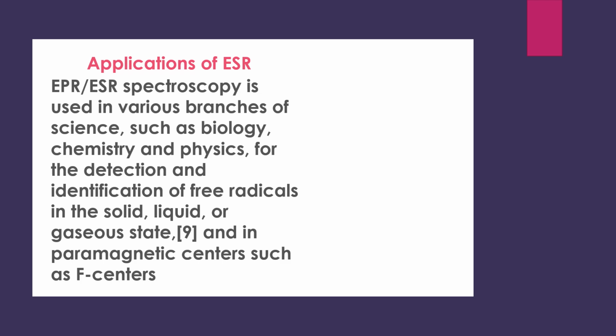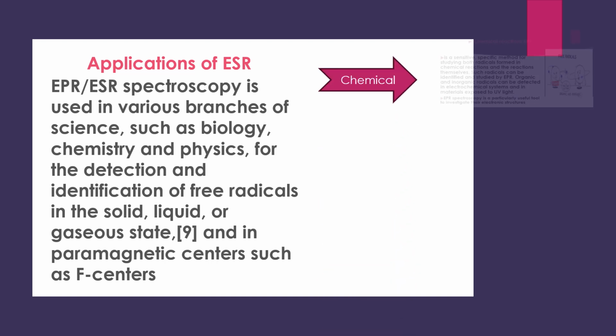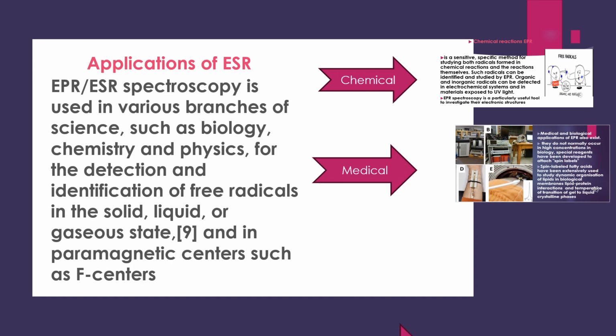Applications of ESR. EPR or ESR spectroscopy is used in various branches of science, such as biology, chemistry, and physics, for the detection and identification of free radicals in solid, liquid, or gaseous state, and in paramagnetic centers such as F centers. Chemical, medical, geology.